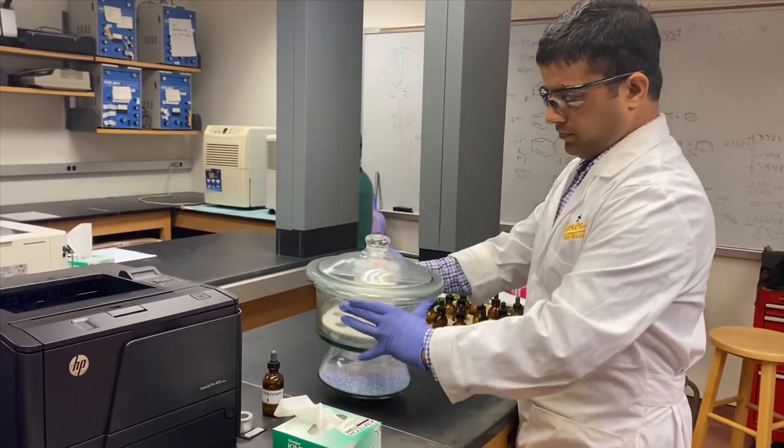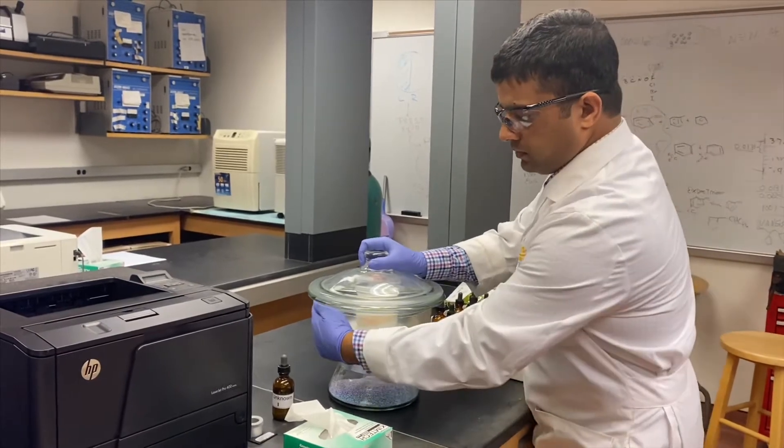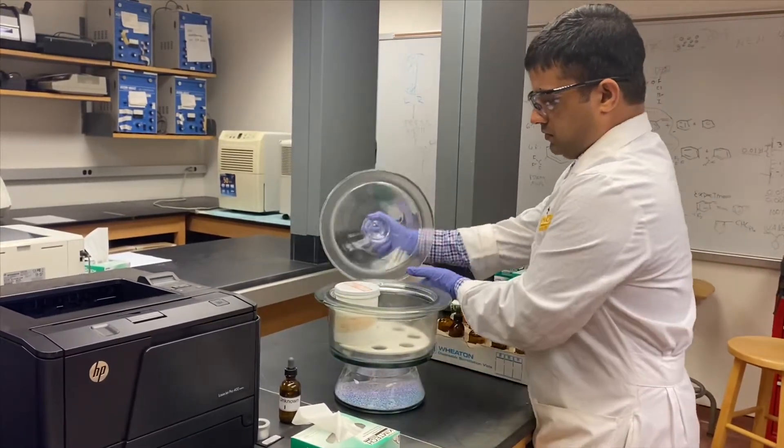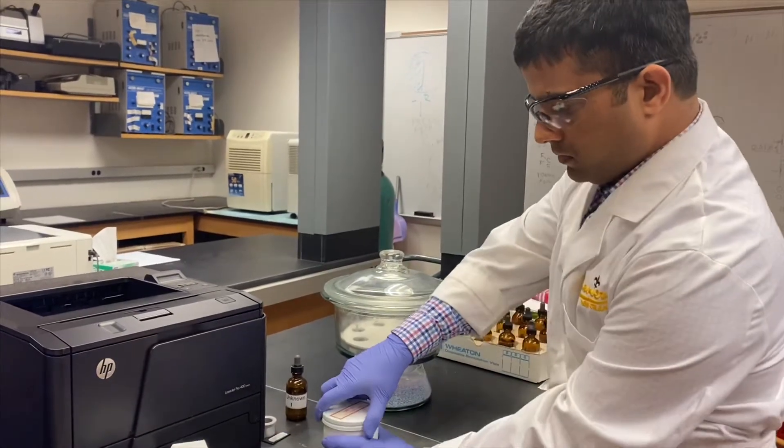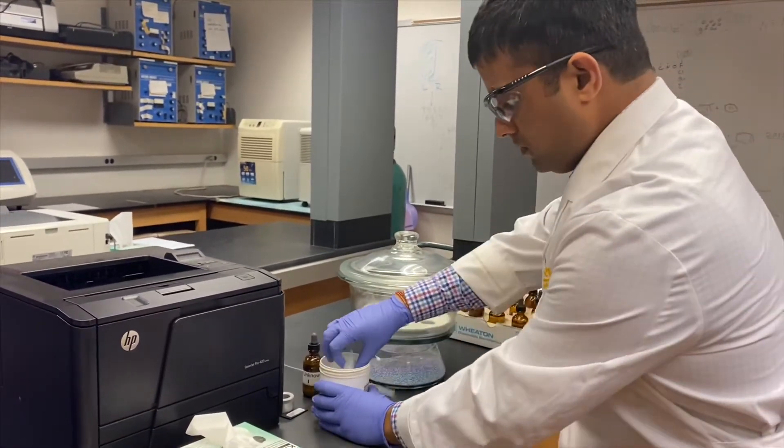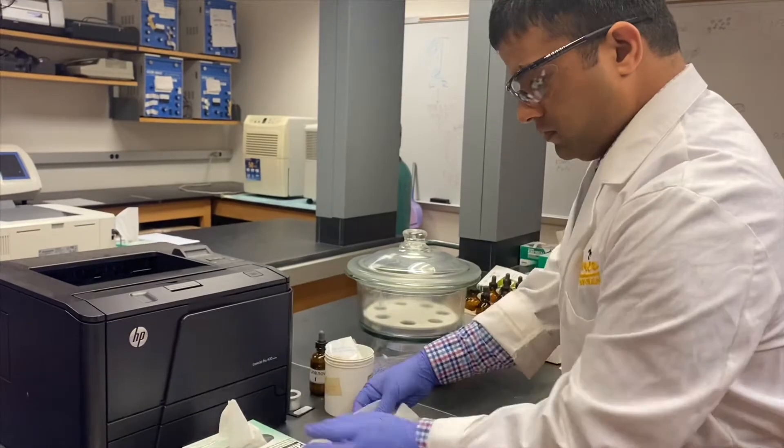This is a desiccator where we place material to avoid moisture from air. Slide it and take out the box of IR plates and place two salt plates on kim wipes.